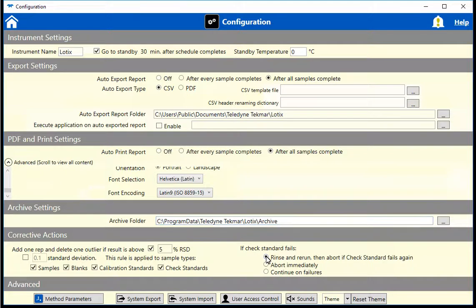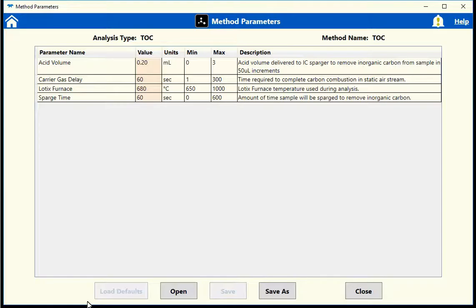Under Advanced Method Parameters, you are able to make edits to and optimize the methods to your sample needs.